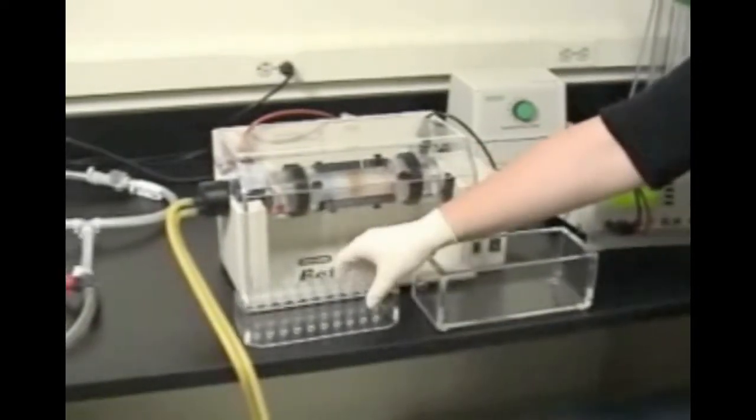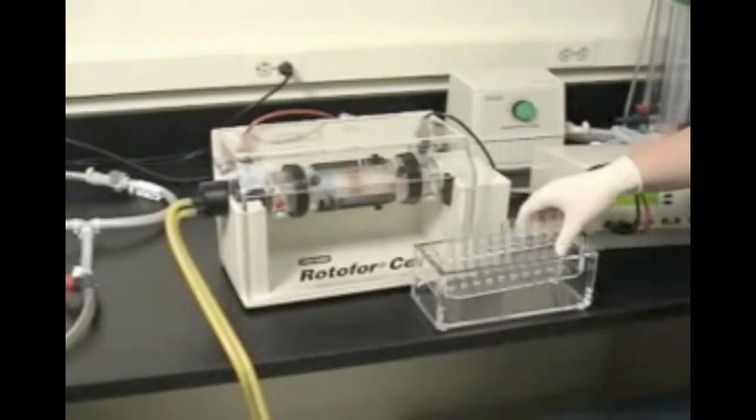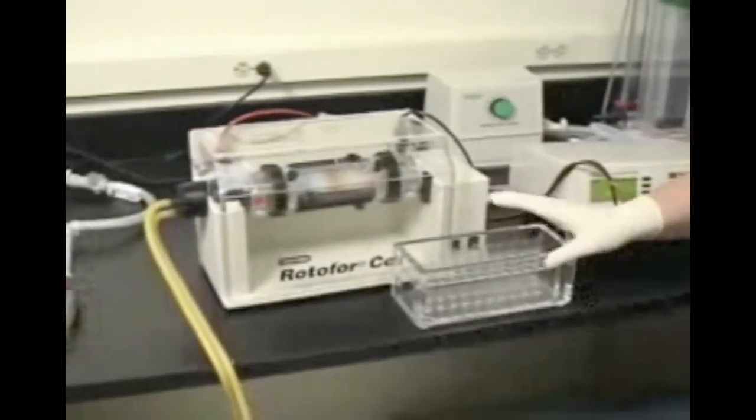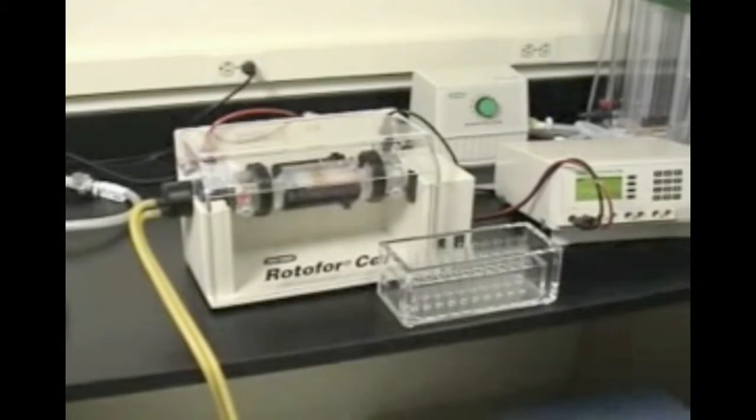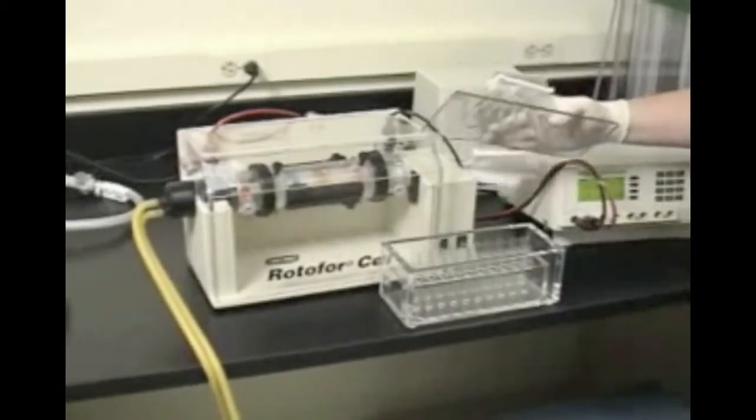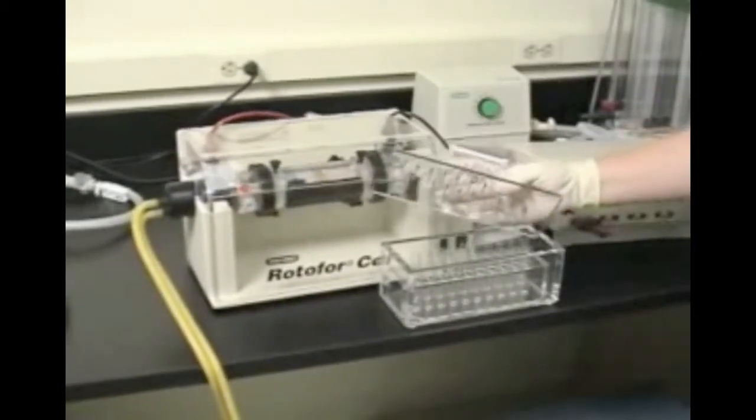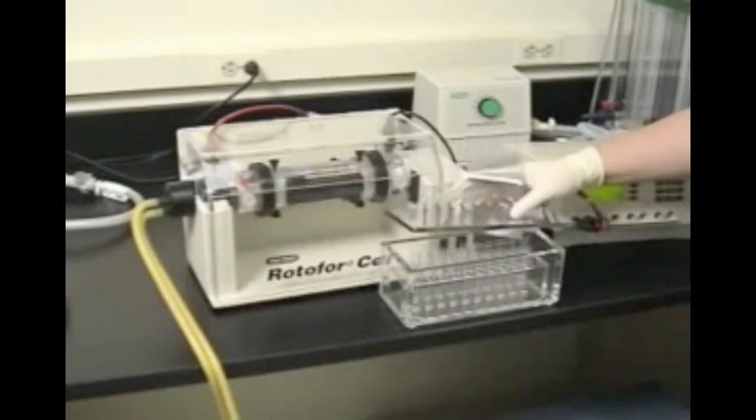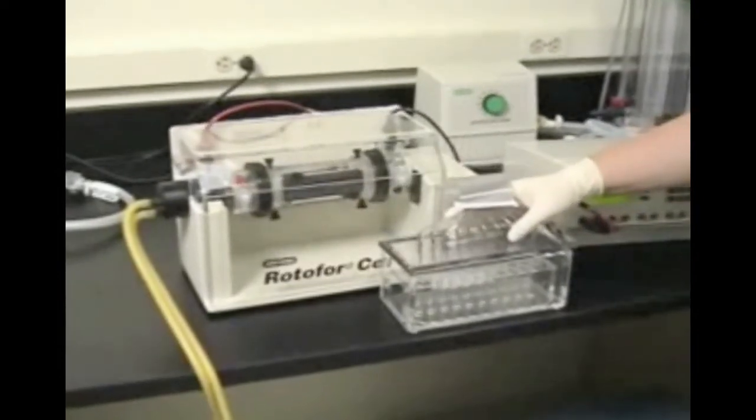In the meantime, load the test tube rack from the harvesting apparatus with 20 culture tubes and place it inside the harvesting apparatus. Place the lid on the apparatus making certain that each stainless steel collecting tube is inside a test tube.